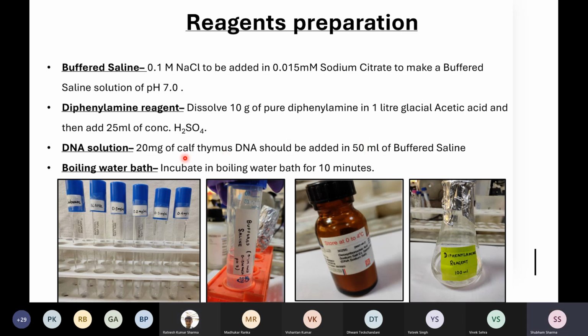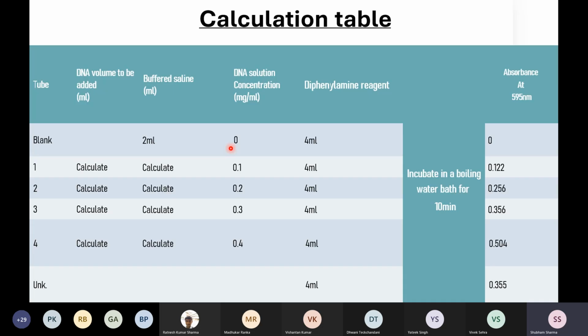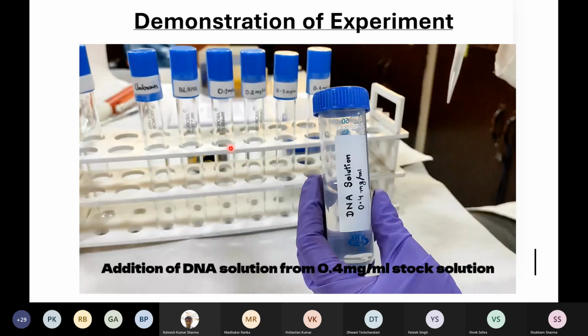Okay. So the next step, after preparing all three solutions, we have to start our boiling bath, because before doing all this experiment, it first takes time to reach the boiling temperature. After preparing the solution, the next step is that we have to prepare the reagent. Can you see my slide of the demonstration of the experiment? Yes, sir, it is visible.